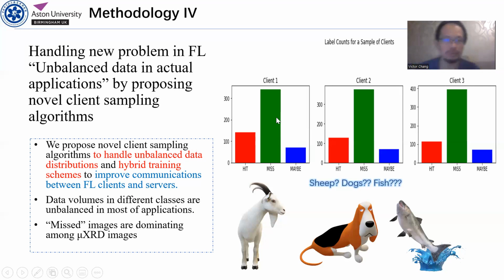It's not just a problem for that, but also due to the fact that scientists have their own images, and we do not even know what they have, because we are supposed not to know. The server should just serve its purposes. However, it's also important that we process them correctly. Otherwise, you may not get the right type of results. Then you can see maybe it's the one you can further analyze, so that at the end you can get the right data.